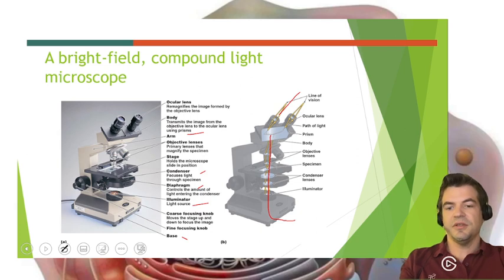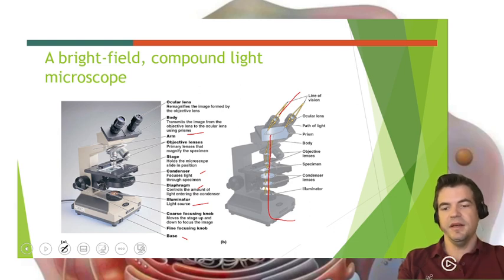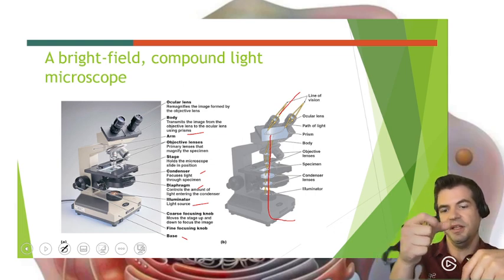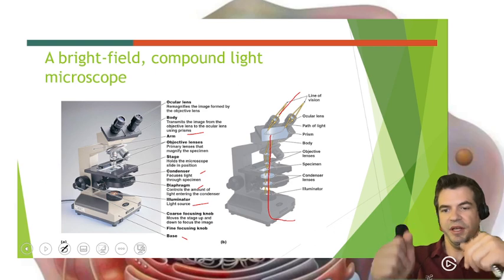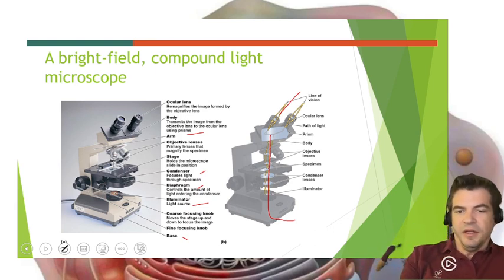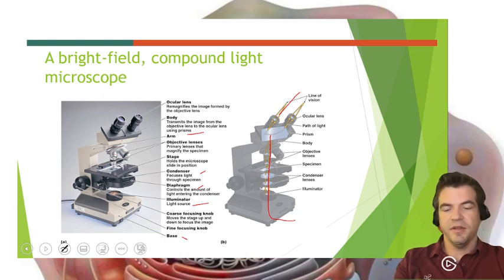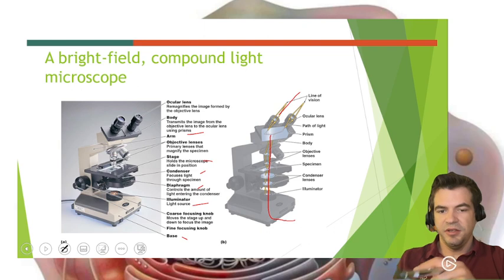The condenser brings the light closer and further, and the diaphragm kind of closes the condenser and the light beneath the stage, so you can let less light through depending on how much you need. Okay, so that is our light. Once we have our light, we need our specimen on the stage, being held by stage clips. We will position it using the stage knobs.